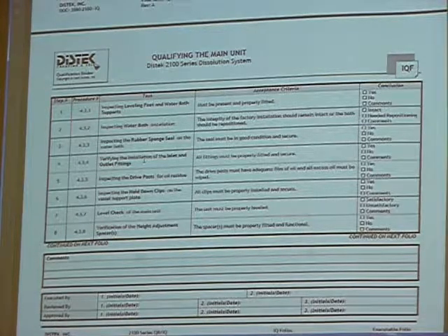Typically when you get a new one or a moved one, in your case you're not going to get a new 2100, but maybe it's a purchase one off of eBay, or maybe they purchased something off of another website, or maybe they got it from another laboratory, it's going to move to their laboratory. You're basically just going to take the unit, fill it up, let it settle down again. Once it's filled up, because it takes 22 liters of water to fill up a bath, you're going to re-level it again. That's leveling the dry plate. You want to make sure that it's nice and level again.